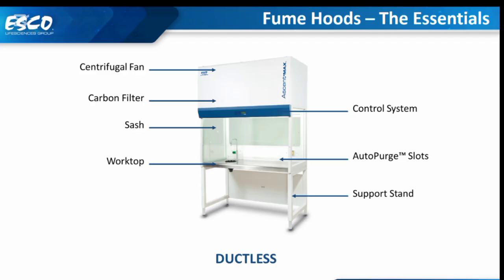Then the ductless fume hood, the fan is placed inside. So remember that the ducted fume hood doesn't come with the fan in the fume hood. The fan is normally installed with the ducting on the outside of the building. The ductless fume hood comes with the fan already placed inside. Filter, sash, worktop, then the control system, the auto purge slots, as there are some holes here at the back, and then the support stand.